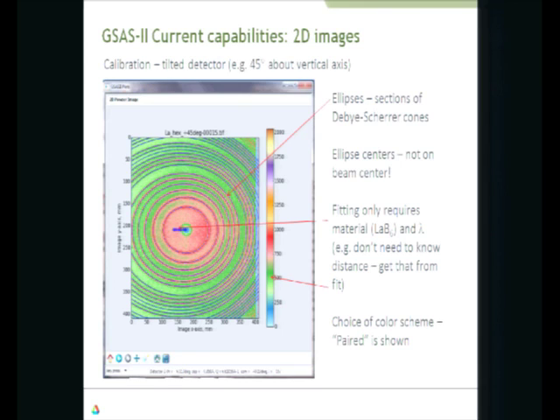And this is showing the calibration and what's permitted. If you look at this carefully, you notice it's really rather skewed because all the plots are ellipses. Actually, I see them as circles over here. But these things are severely skewed. This detector has been tilted 45 degrees to the incident beam. You may ask why do that. Well, some people just do that kind of thing. The other thing is that if I can deal with detectors which are tilted by this much, then when one is slightly tilted, I'm getting the right answer as well.